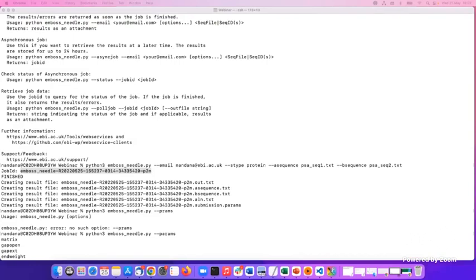It's a number that you are giving while calculating the alignment. If you would like to read more, I think there are links available in the help and documentation. If not, just contact us on support so that we can redirect you to the right pages.